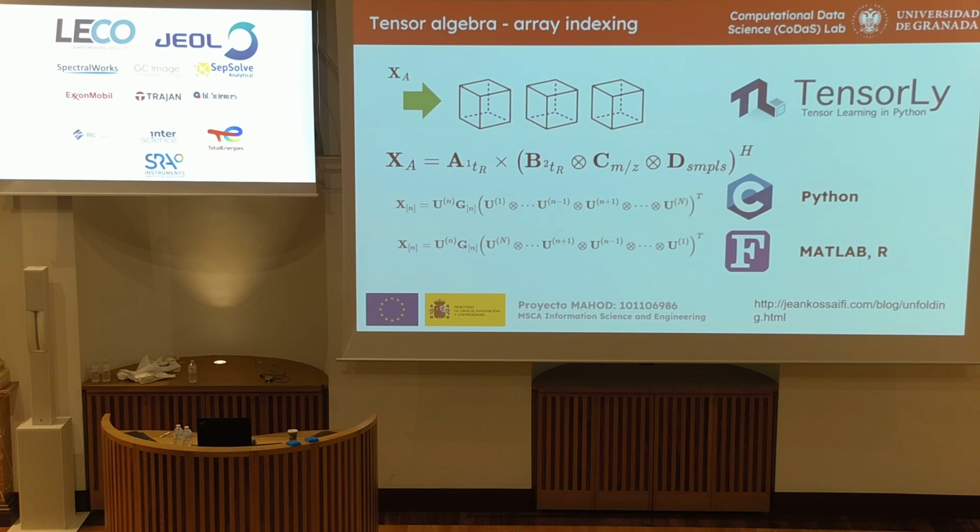This is some nerdy stuff, but basically MATLAB is cringe, Python is based, and that just has to do with where the memory is indexed, how it's stored. But they do the same thing, just in different orders.